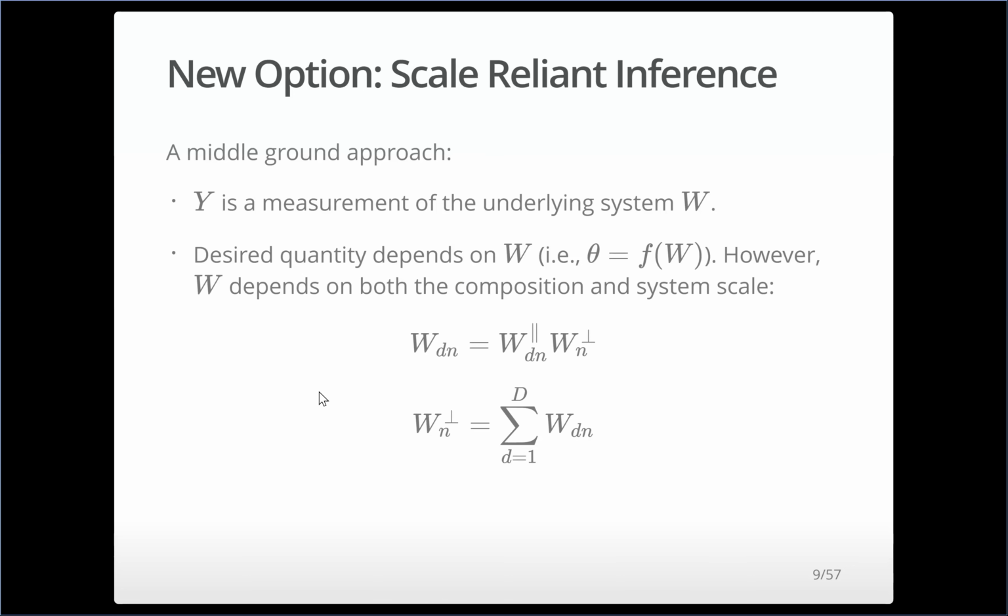And a scale-reliant question is differential abundance, right? We want to know which taxa change in absolute abundance between the conditions. We absolutely need to know how many microbes are in our gut. Correlation analysis also depends on the scale. So there's a lot of common analyses where you need this kind of additional information.